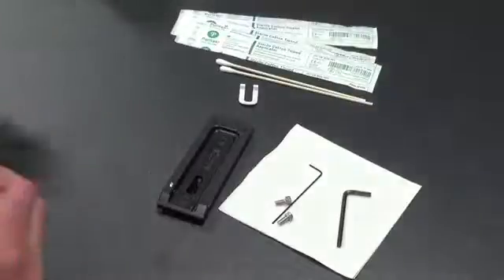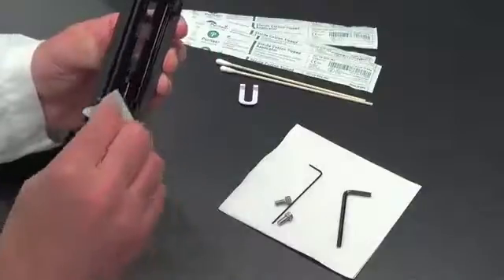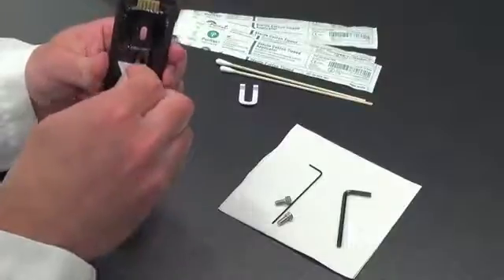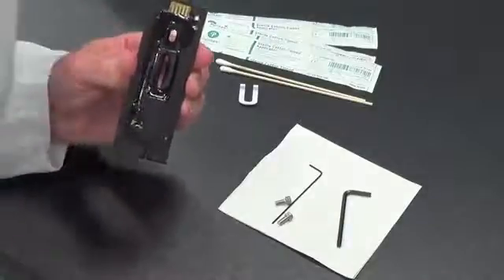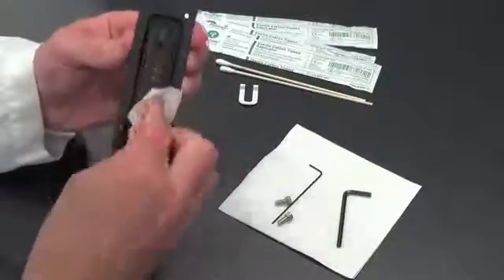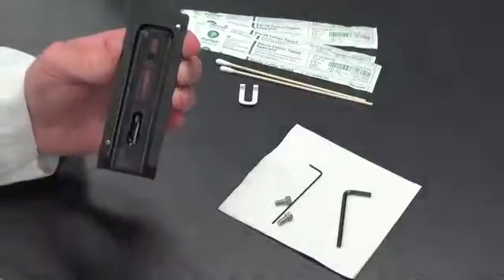In the case of the bottom slide, what we want to do is try to be as careful as possible not to damage the plastic lens cover. So during cleaning, again, apply pressure to clean around the lens and inside this whole slide area as best you can, making sure to remove any dirt or milk that's present, and also clean the back piece here where the reader will look for line development or where the color sensor is on the bottom half of the slide. Again, always remember to use a dry, lint-free cloth to dry any remaining alcohol from the slide. When you're done, the whole slide assembly should look very clean, and there should be no streaks or any contamination shown on the lens here.